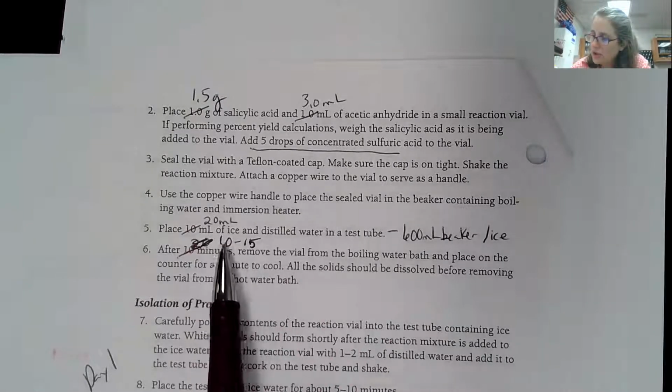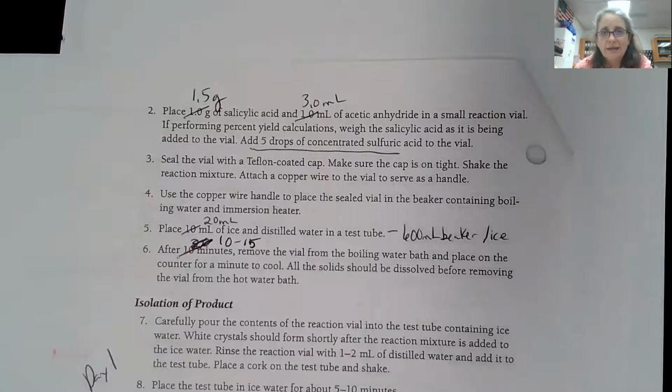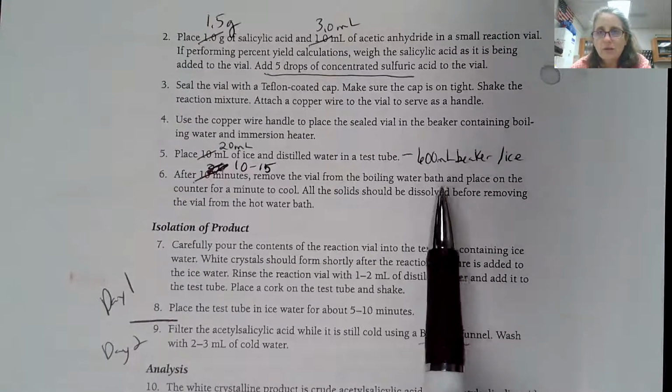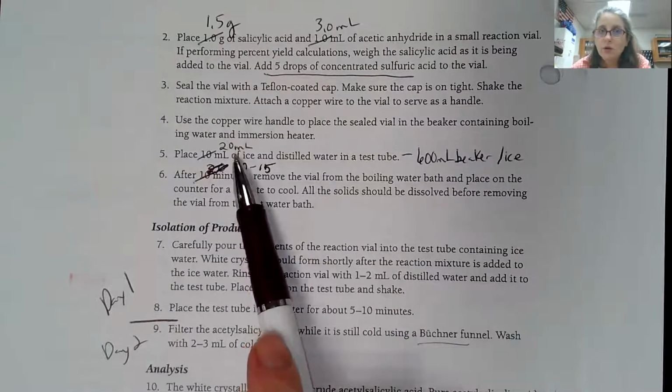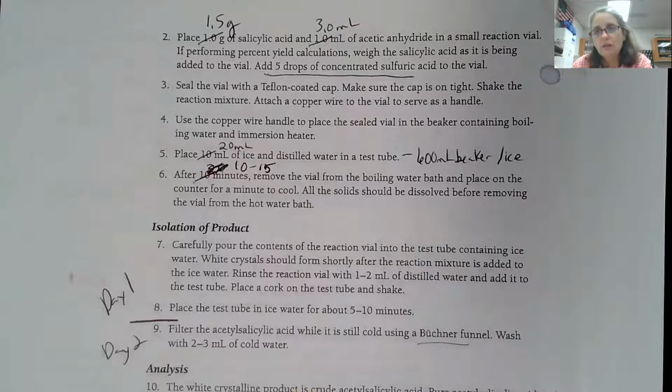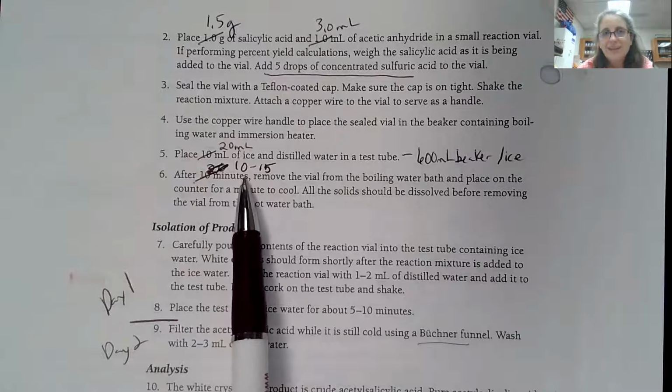Then you are going to create an ice water bath while this is cooking, essentially, in a 600 ml beaker with ice. And we're going to have a large test tube with about 20 mils of cold distilled water in there. And you will see why we need that. And we're going to cook this for a good 10 to 15 minutes.